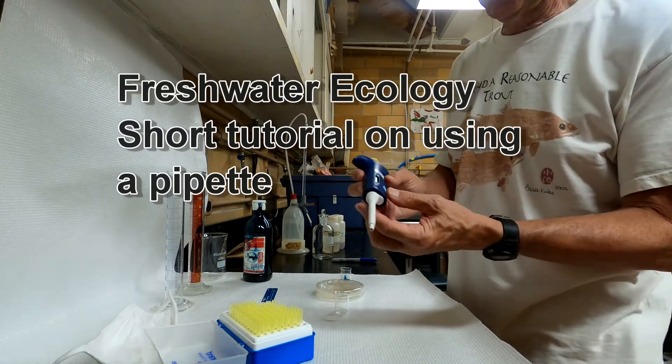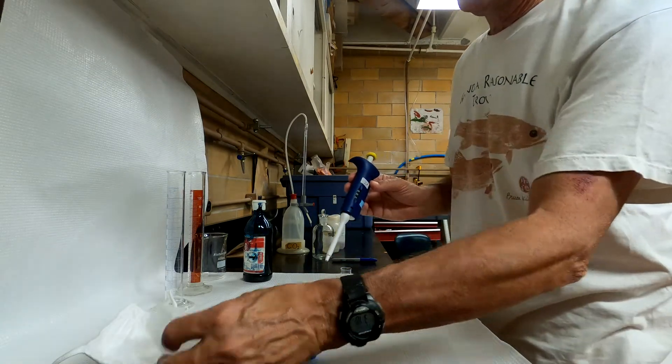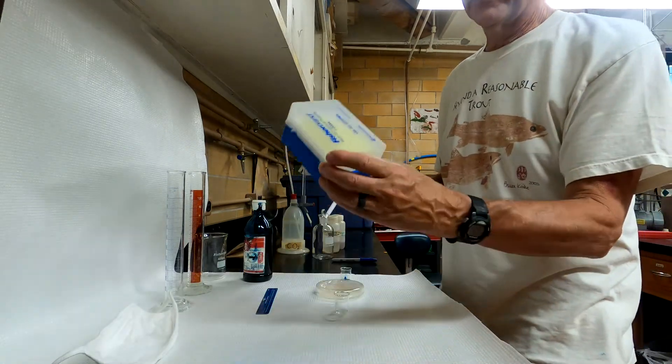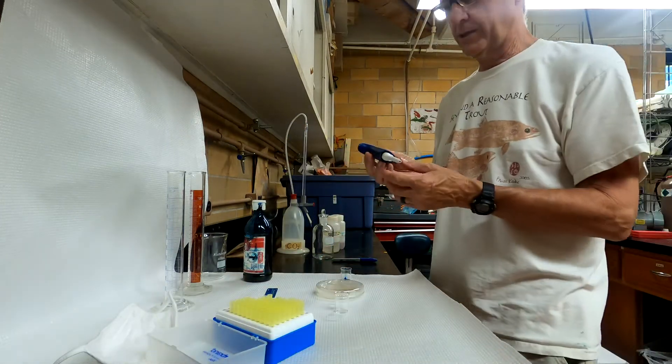This pipette is a 20 to 200 microliter pipette, and we have to match it with the size of tip for it, 1 to 200 microliters, so that should work.